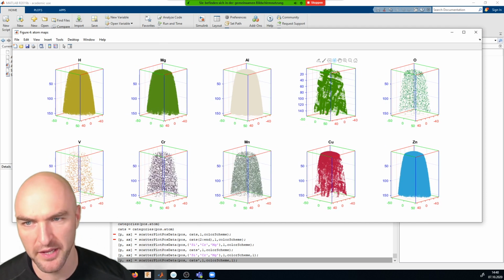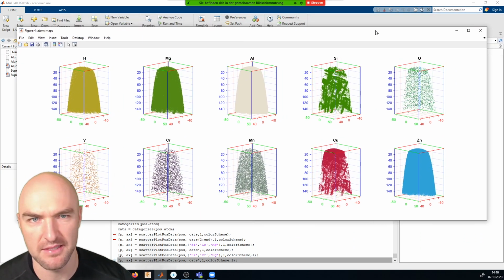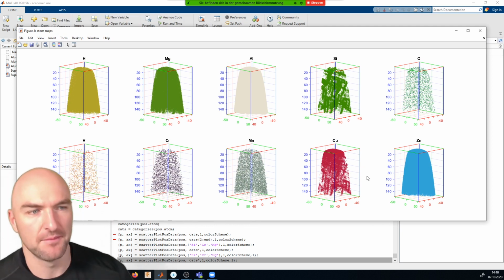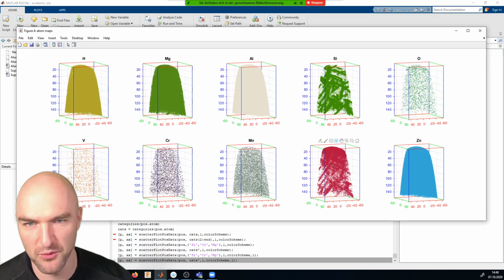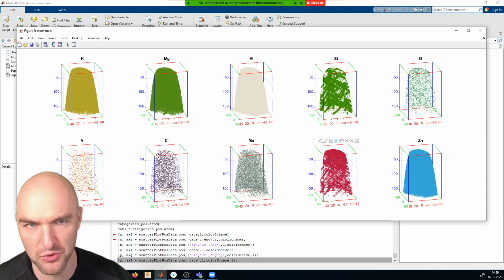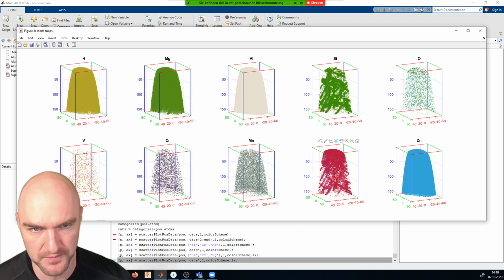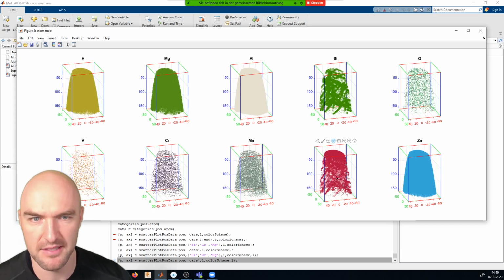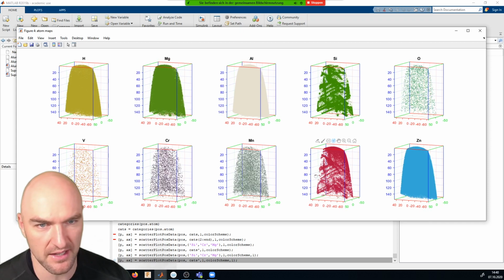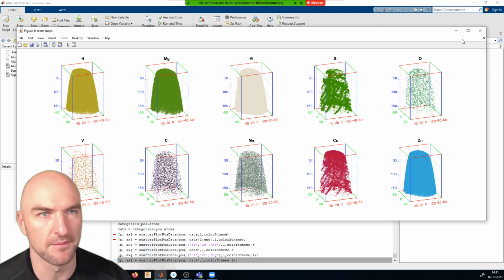And what you can see is that we are now displaying essentially all of the atoms. So you can see this for a relatively large data set. In the past, MATLAB wasn't actually that fast with the graphics system, but they have moved to a graphics system where they're really using the GPU to its full capability. And this computer has a very big, very expensive GPU. And you can see even with all of the atoms displayed, so really displaying all of the 23 million atoms, it still moves very smoothly and doesn't have much of a problem keeping up with the data.